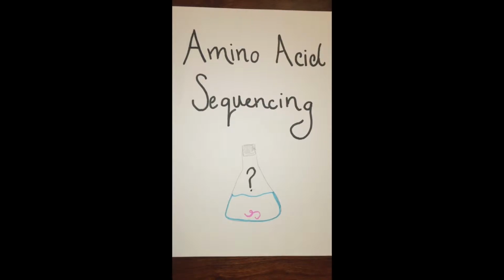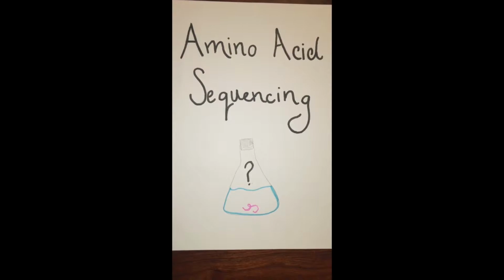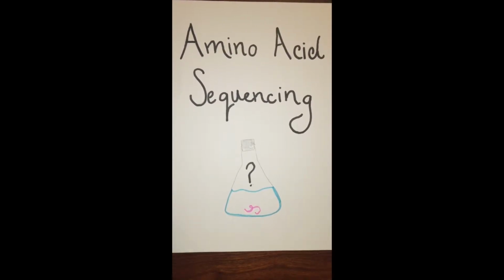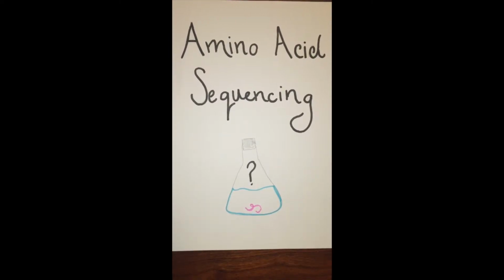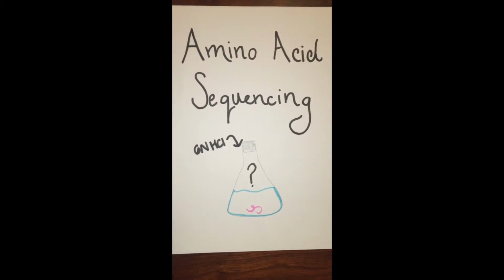We have been tasked with sequencing a purified protein to discover its primary structure. The primary structure determines the protein's structure and its function. The first step in sequencing our mystery protein is to degrade the entire chain using amide hydrolysis. This breaks apart every peptide bond in our chain and gives a mixture of free amino acids.